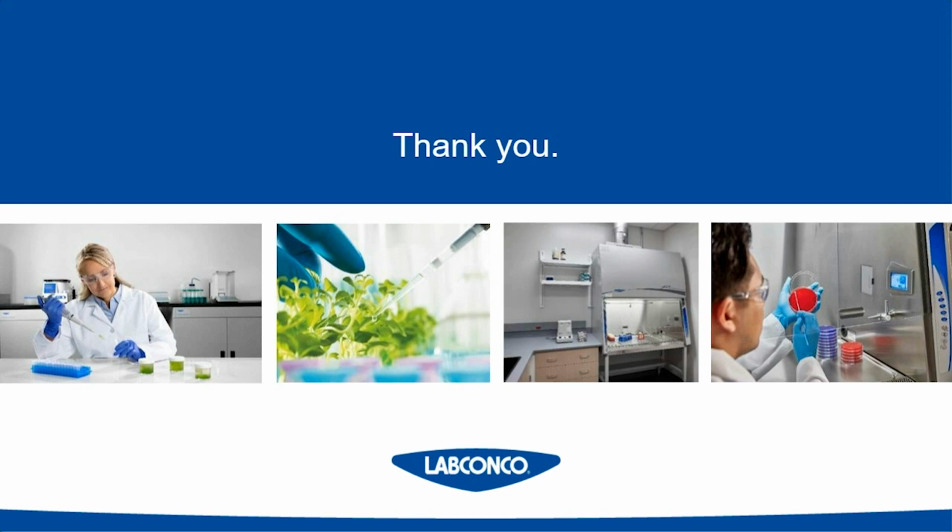HEPA filters in a biosafety cabinet can last 7, 10 to 20 years. It really depends on, one, if your process is generating a lot of particulates or dust, your HEPA filters are going to be used much quicker. Or if your labs are very dusty or dirty, the HEPA filters are not going to last quite as long. But in a general cell culture lab, I would say you could expect 7 years or more out of your HEPA filters.